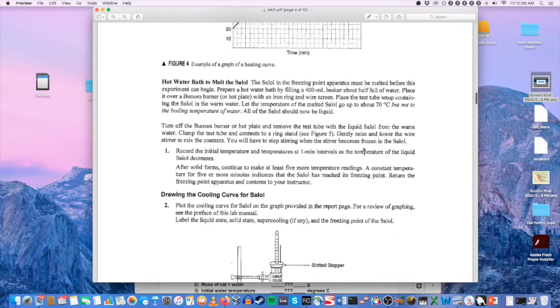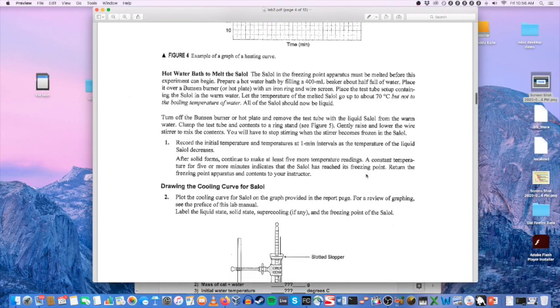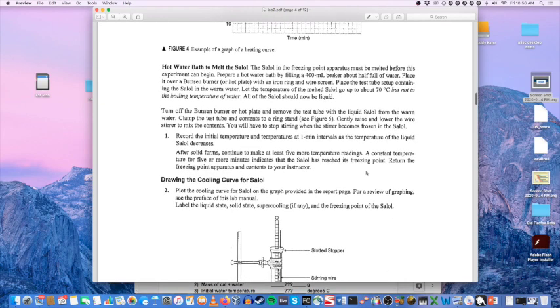And I'm holding the stopwatch in front of the camera so that you can see the time as it clocks in. Near the end, we will watch the solid form again as it passes through its freezing point, and you'll notice a dip below the freezing point, a supercooling phenomenon where the temperature goes low and then increases again as the solid forms.